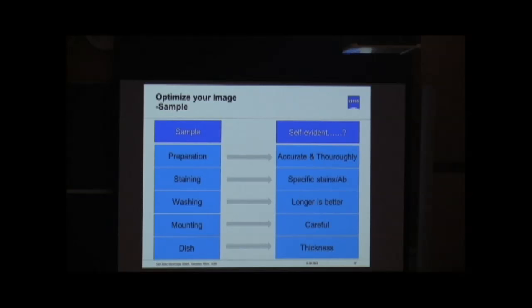And when it comes to the stainings, and this is something even more important, reconsider whether there are new and more specific stains, more specific antibodies out on the market that give you a more specific signal. Right? And when it comes to washing any kind of stains, for instance, antibodies, also always keep in mind, don't save time on the washing procedure.